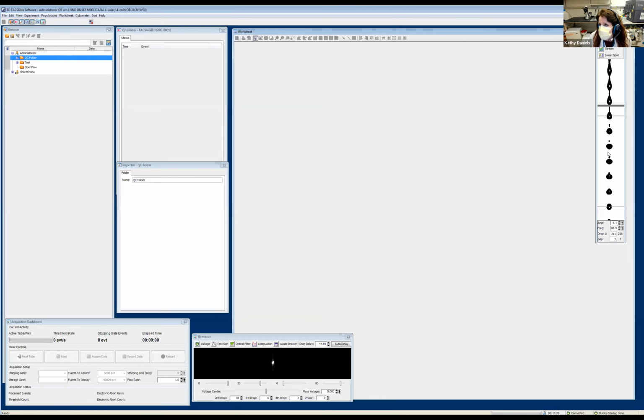And the manual from the BD FACSAria instrument tells us that it wants us to have those satellite drops reattached within about 6 droplets. So what we see here is this formation of the droplets is looking very nice. Just to show you what happens if we adjust the amplitude, I'm going to change this value right here so we can see in real time what happens if we do make that adjustment.